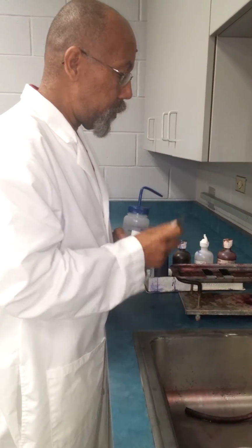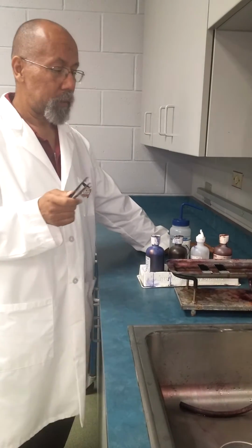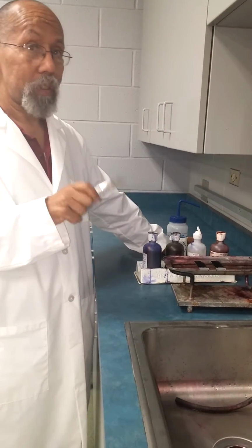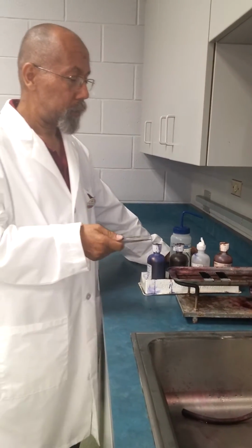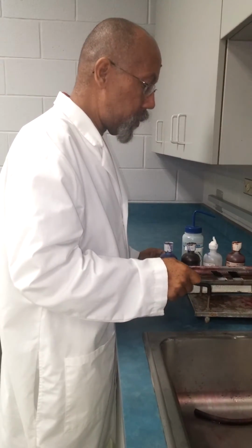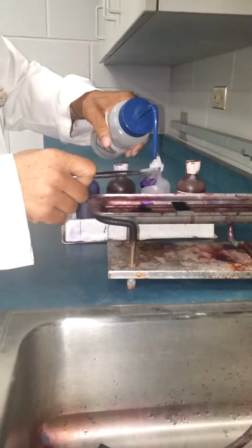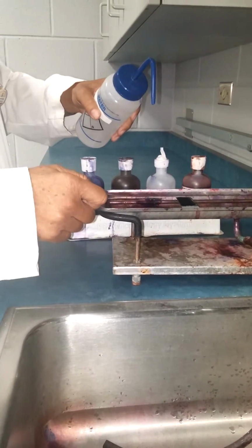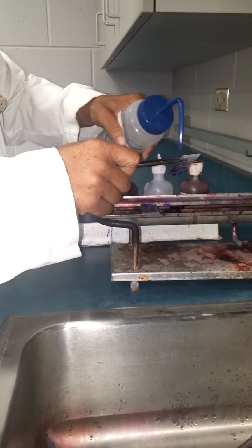What does the crystal violet do? The crystal violet stains all organisms. What we refer to as gram-positive and gram-negative both stain with the crystal violet. So after applying the crystal violet, we're going to rinse it off with water.